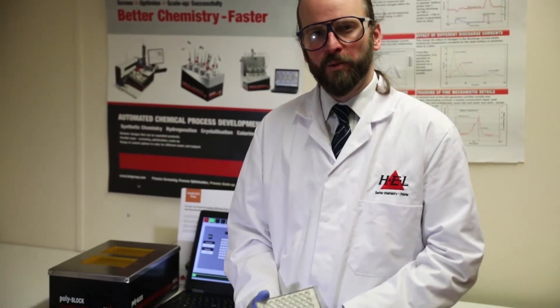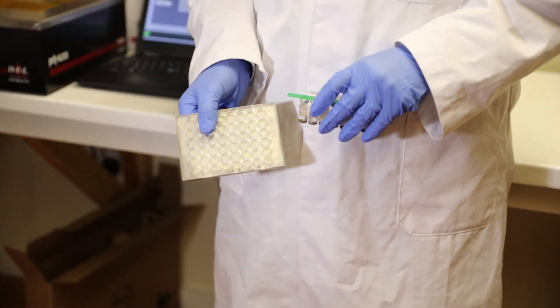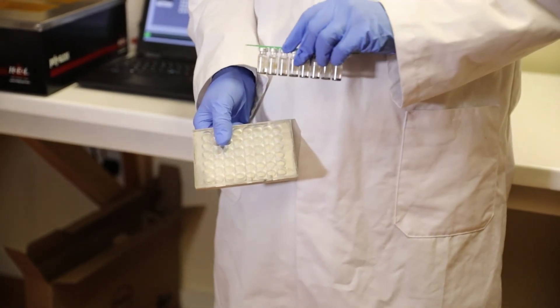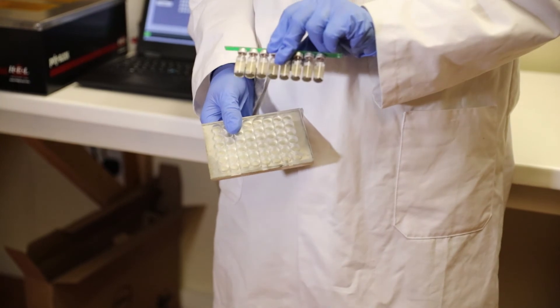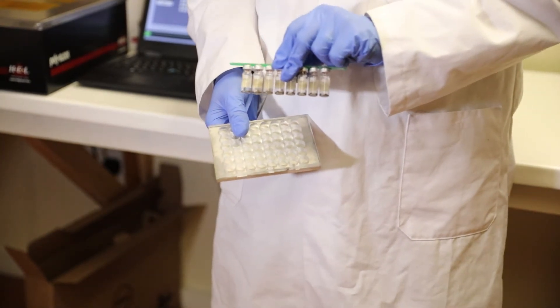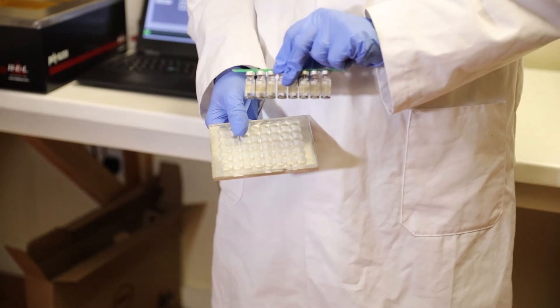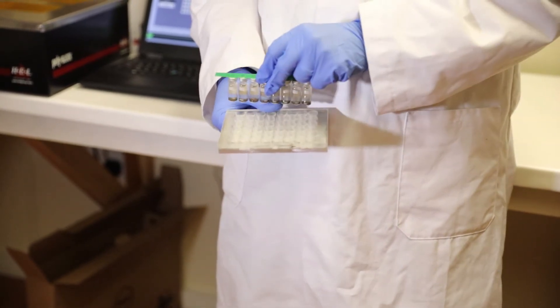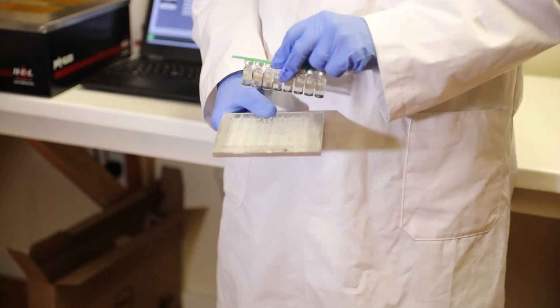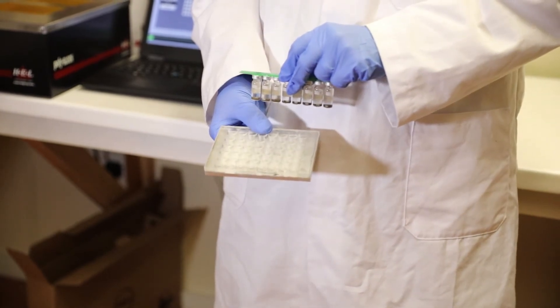Today we're going to give two examples of stirring on the PolyBlock Plate. First is this 48 position rack. This is from HPLC vials and we've got a set of vials here all glued together just to make it a bit easier. In each of those is some sand and a magnetic stirring flea. We're just going to go through and put them in each of the six positions to show just how quickly this kicks up and mixes the sand.